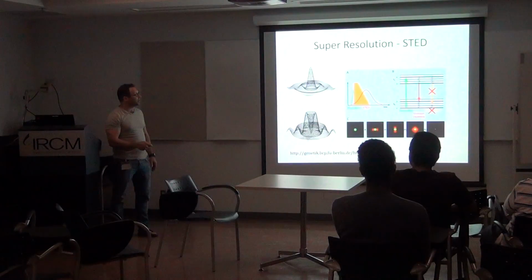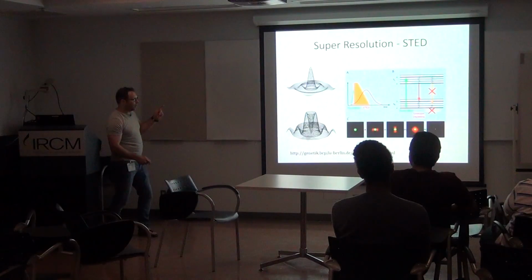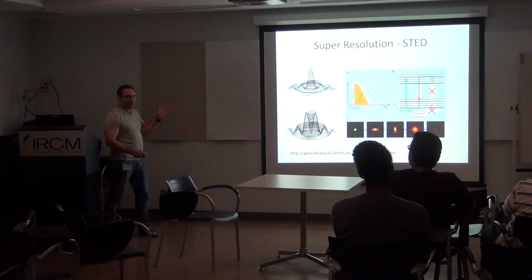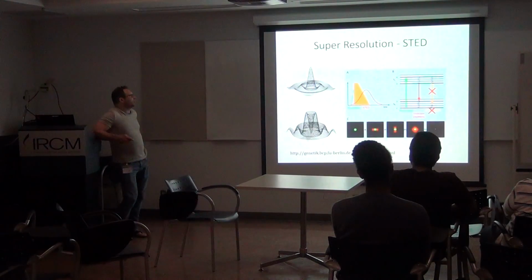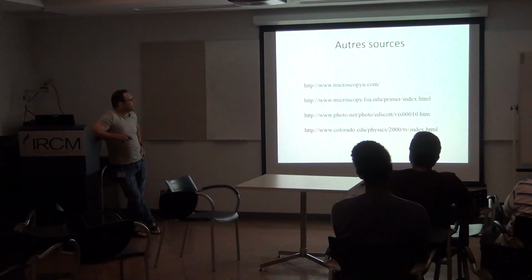Same thing with STED. You excite it, and right after you de-excite a couple of them, and you just look at the ones which stay excited. Okay? This is how it works. So that is mostly super resolution techniques.